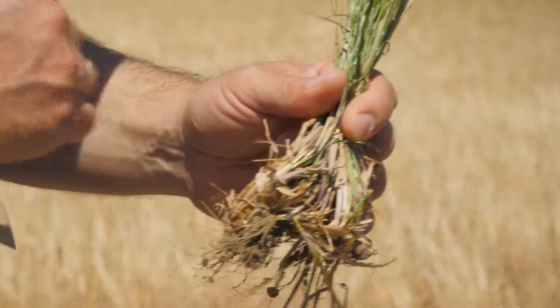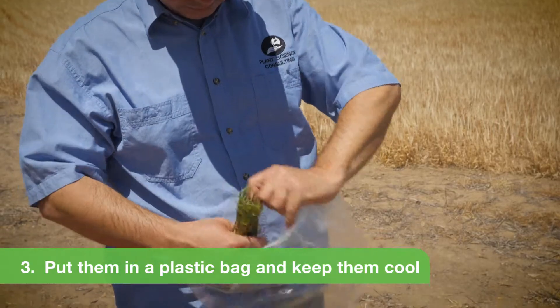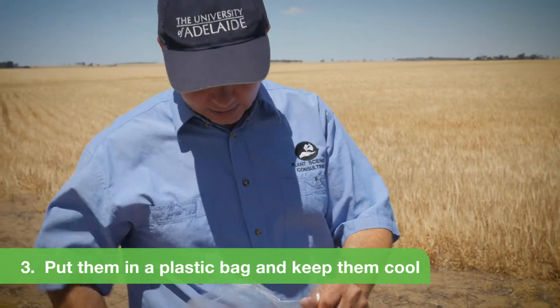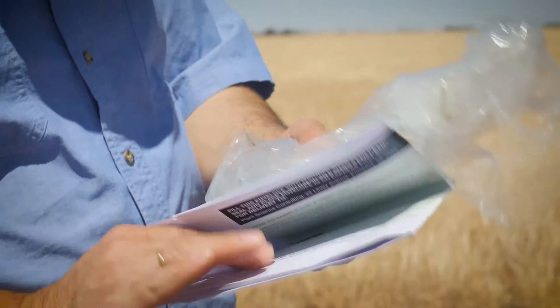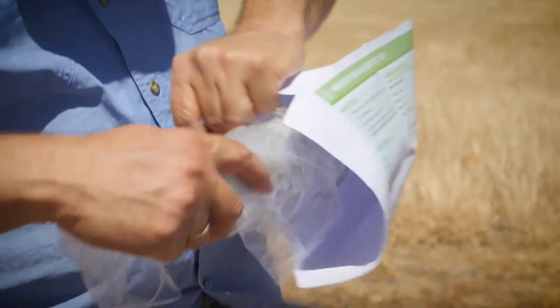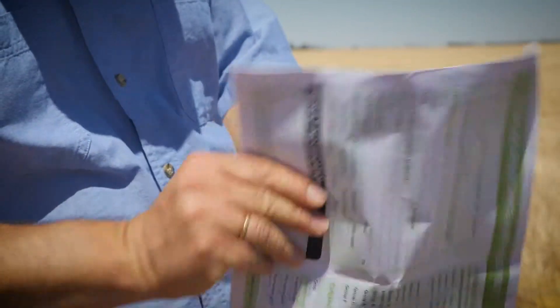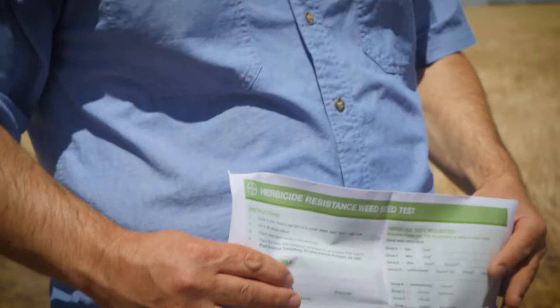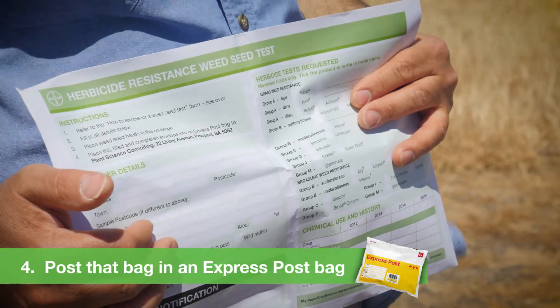These plants are simply placed in a plastic bag — no water, don't need to add any water at all — and kept out of direct sunlight. If you pick them on a Friday, you maybe put them in the fridge and post them to us at the beginning of the week, as that's a lot better because they get to us during that week. They can then be placed in the Bayer bag. Write down the information. This bag needs to go into an Australia Post Express Post bag, because we need these plants to get to us within about four or five days — you don't want them to take two or three weeks with regular mail.